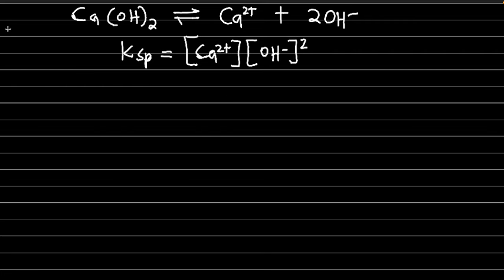All right, now remember we're going to do this for the 3 trials, trial 1, trial 2, trial 3. But you don't really have to solve all of them for the 3 trials. If you solve for 1 trial, it's okay, because the values, if not the same, will be very similar. If you look at the values we've been obtaining for the trials, they're almost equivalent.